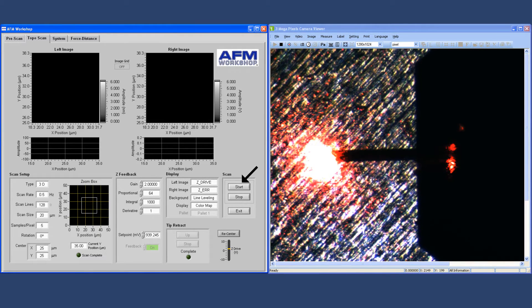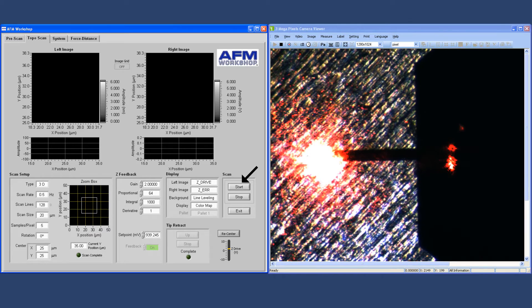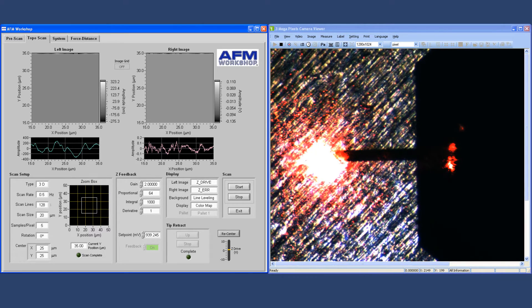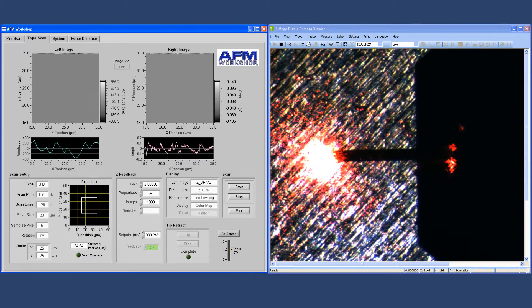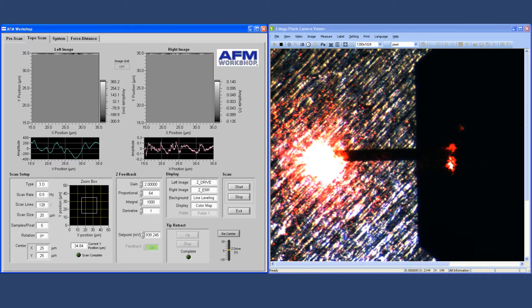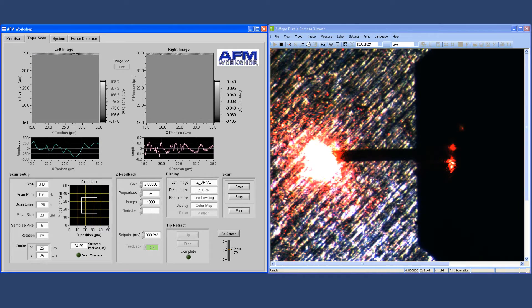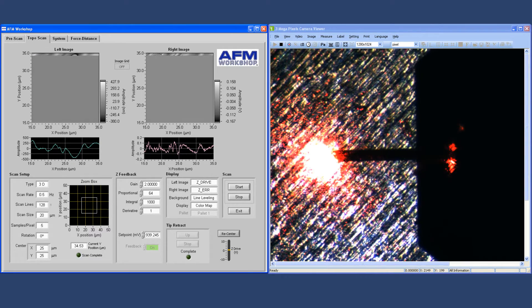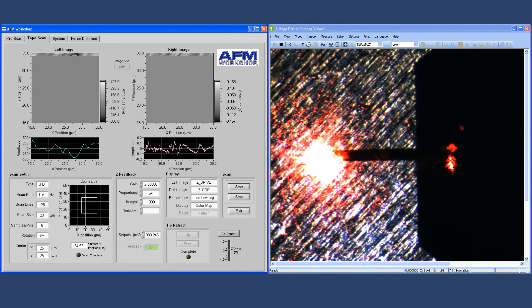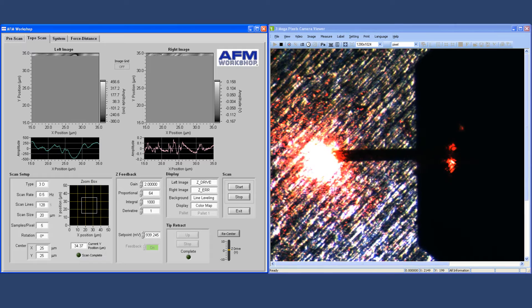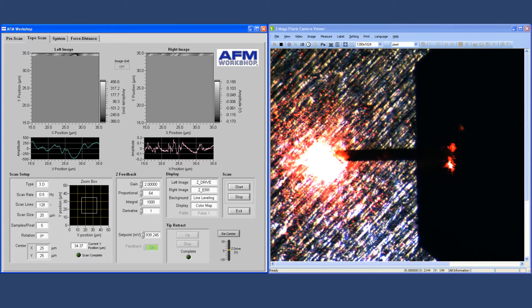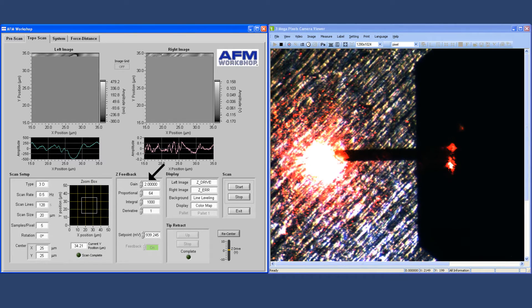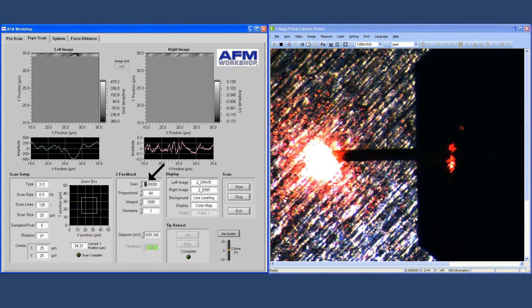The sample scans back and forth below the tip. The image appears on the computer screen. Now, if you want to optimize the PID parameters, you can do that. As shown here, we change the gain of the microscope from 2 to 8.